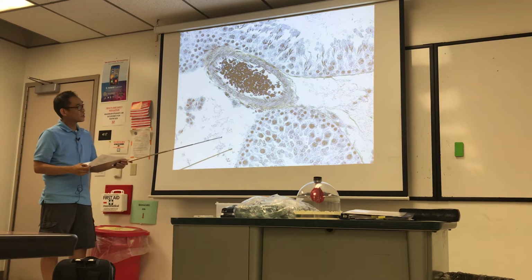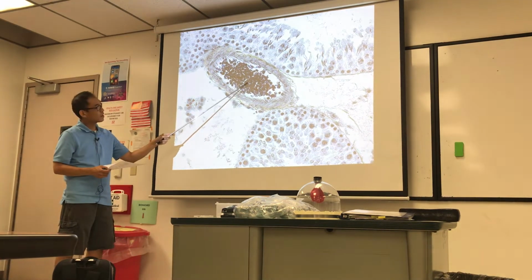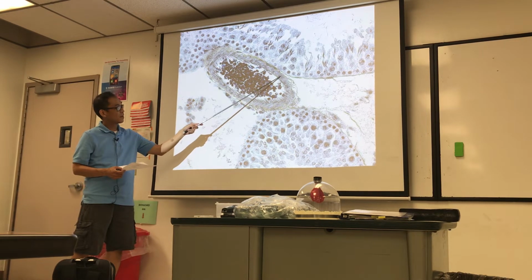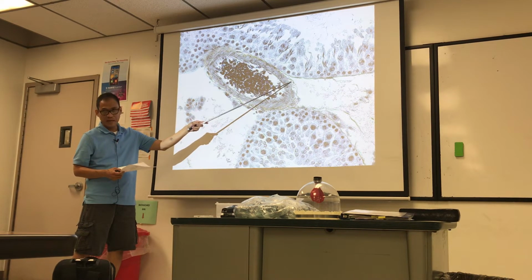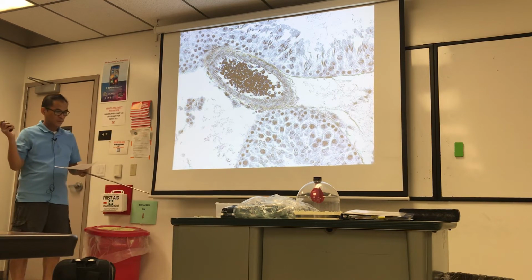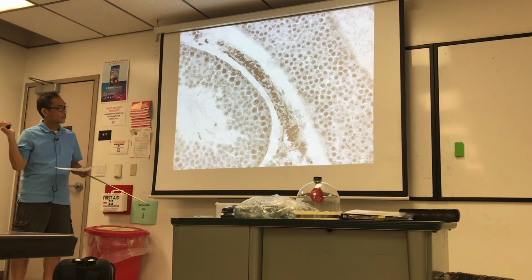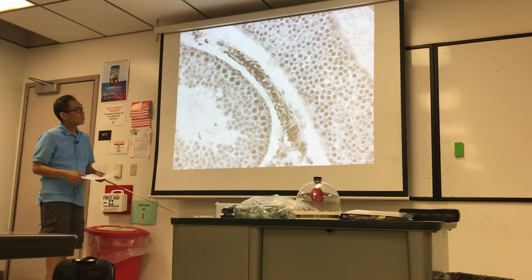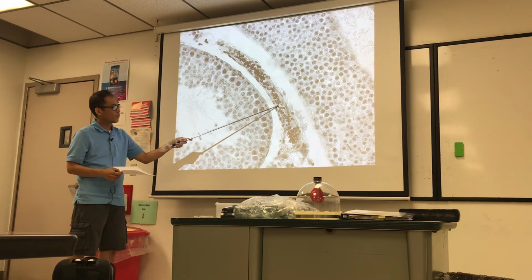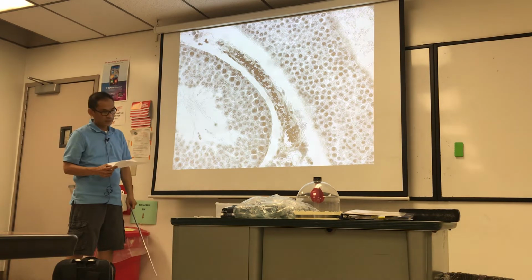This is a slide where you have a muscular artery. There's the red blood cells, and look at the size, the caliber. There's a TI, TM, and this outer layer here, again, TA. You have all three layers in that muscle. This is the rat testes slide. That's a muscular artery. Now this one's a capillary, and I chose a vessel where it looks like it's about a width of a single red blood cell. That qualifies as capillary, so that's what we're going with here.